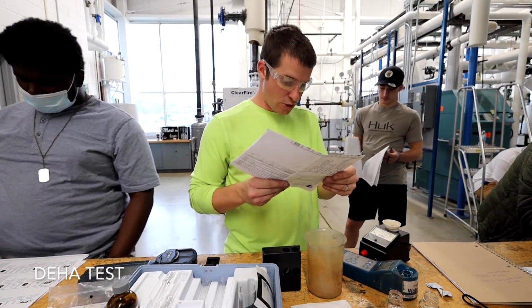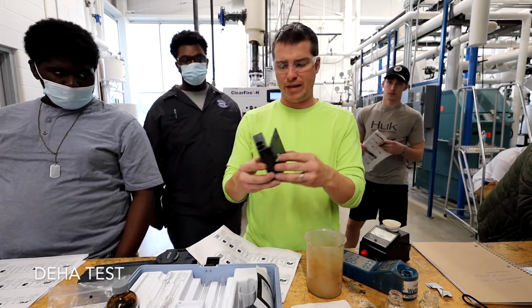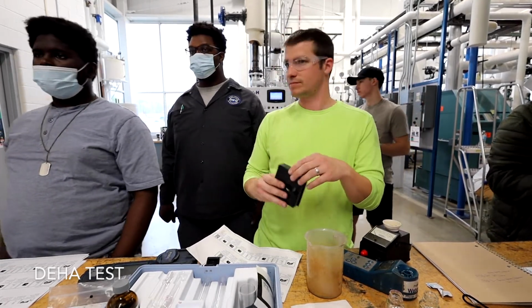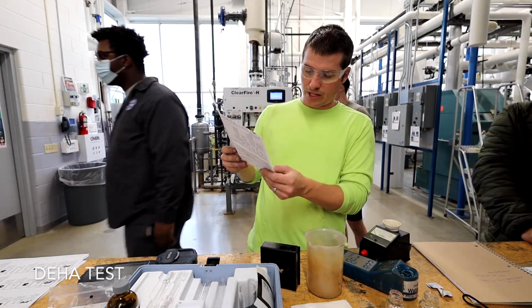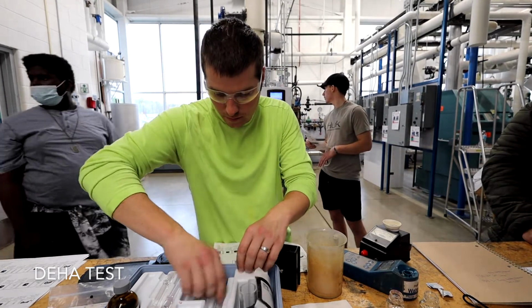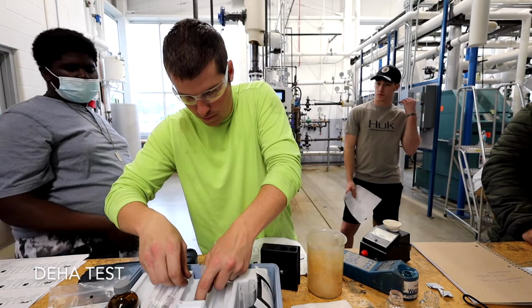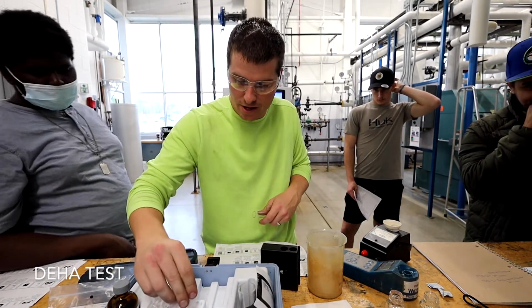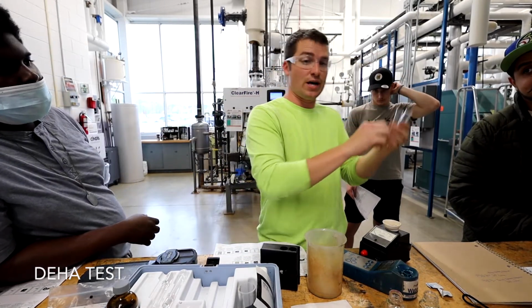All right. So remove the long path viewing adapter, insert the color disc, which is already done. You can kind of skip that. We keep the color disc in here. Okay, so rinse and fill a tube to the bottom line with solution B. So you've got these 2 tubes in here. What a mess. Don't put the caps on, they're easier to grab. Okay, so you have your 2 little tubes, and again, these weren't rinsed out either.